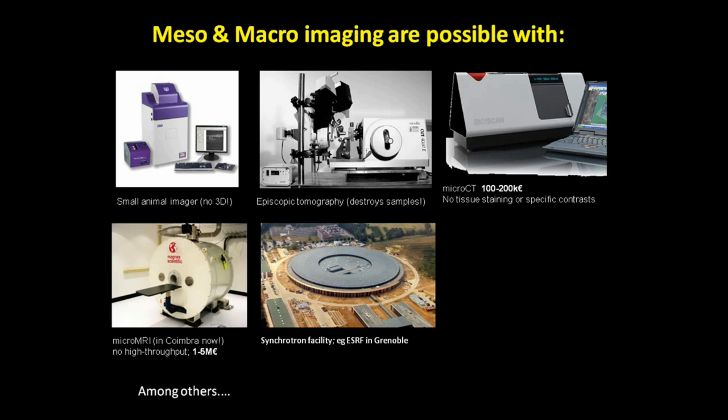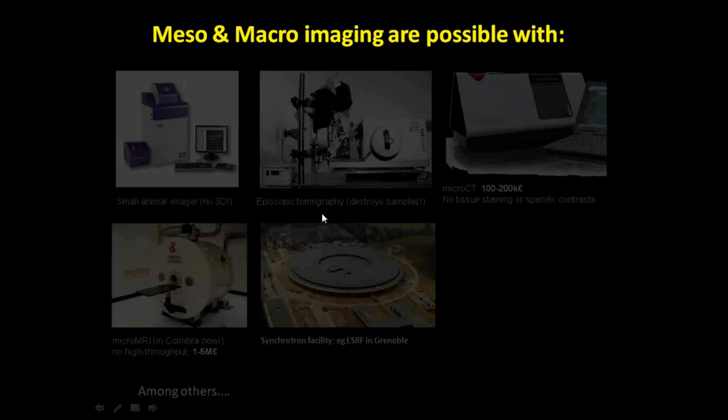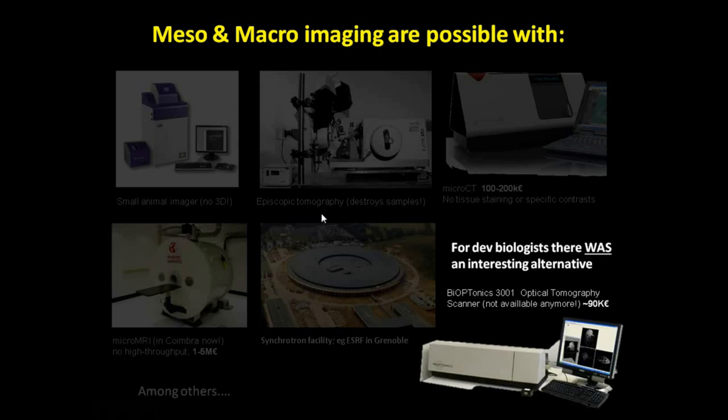These are quite expensive. They can give you quite a lot of detail, but as I've discovered, in fact, with optical tomography, you can get detail that even surpasses the detail you get with these machines, with far less expenditure, I may say, or a synchrotron facility. That's another higher order of magnitude, which is not really easily accessible for biologists.